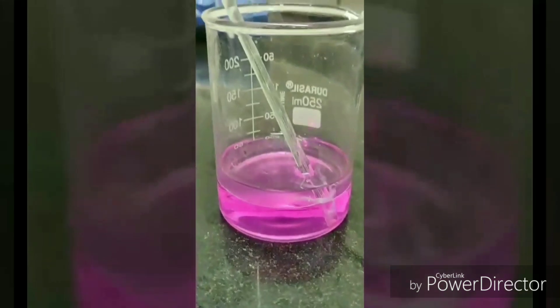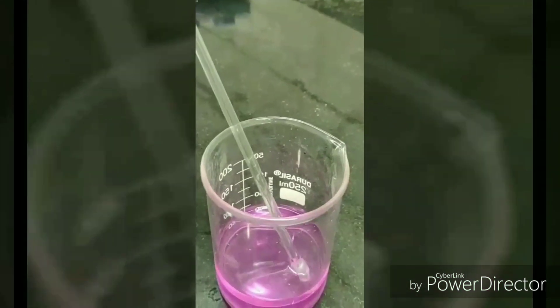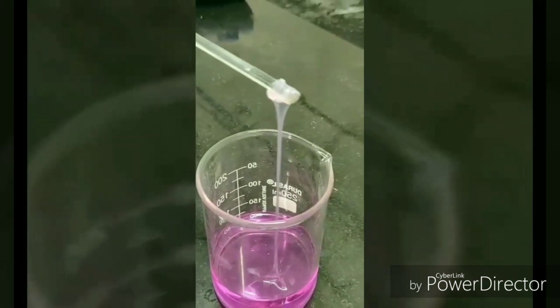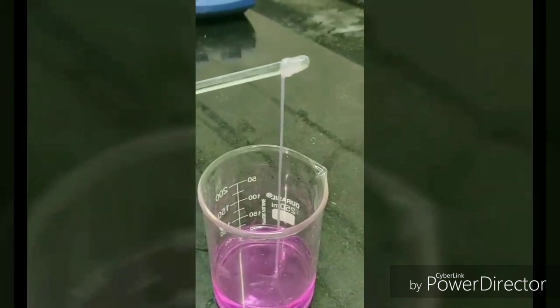As we can see, there is a clear separation between the two layers. Our product, nylon, has been synthesized and can be grabbed out using the glass rod.